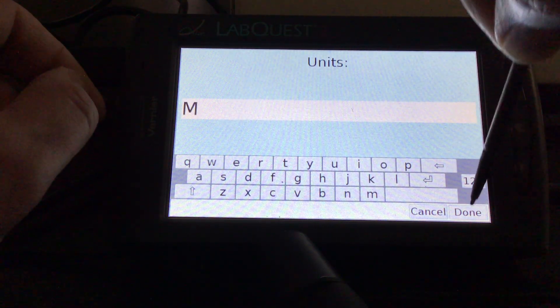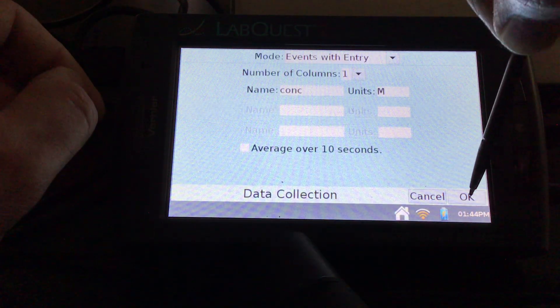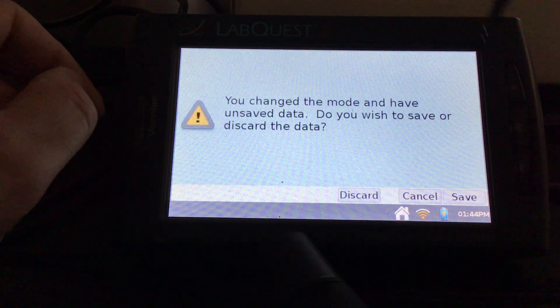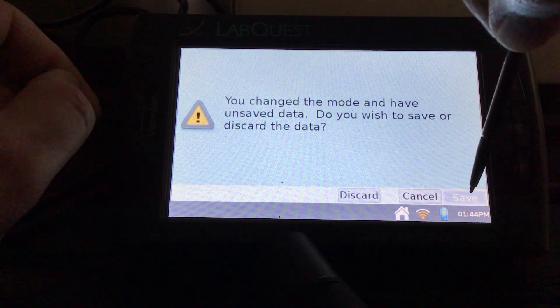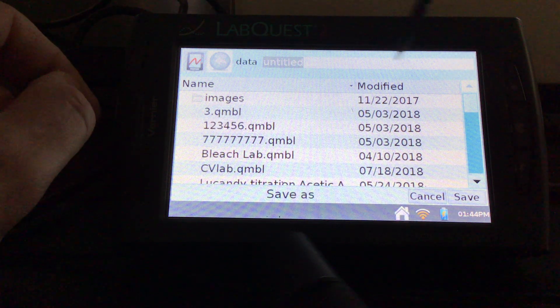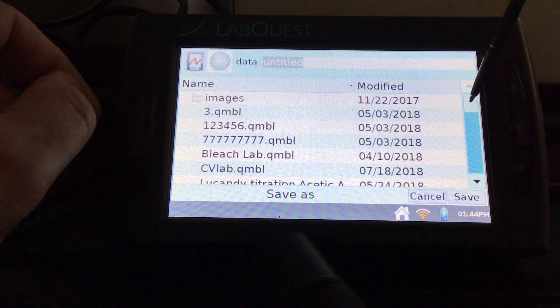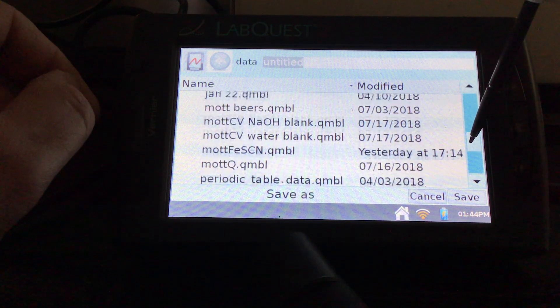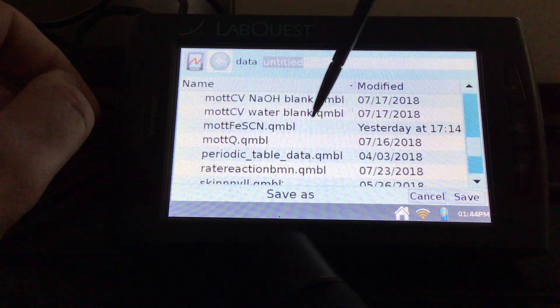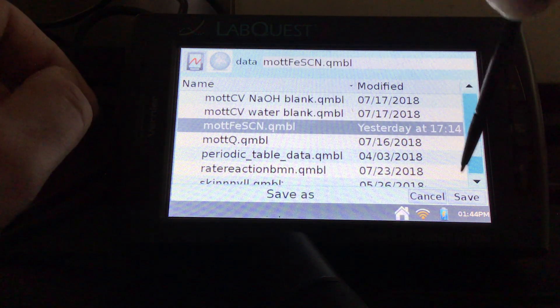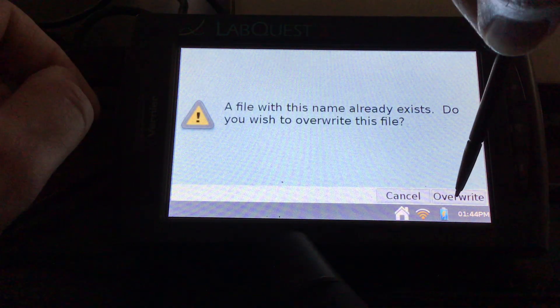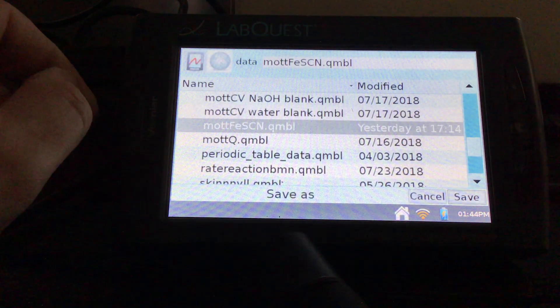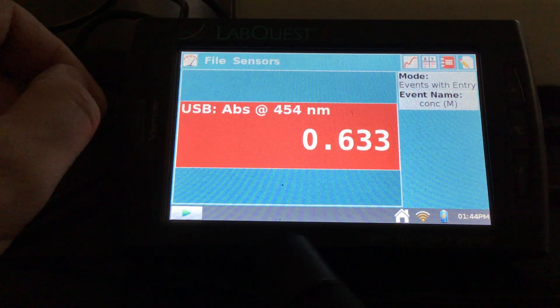All right. There we go. So let's go ahead and save this. And I'm going to overwrite something I already had in here. So I'm going to overwrite that because my data wasn't great. Hit save. We're going to overwrite it.